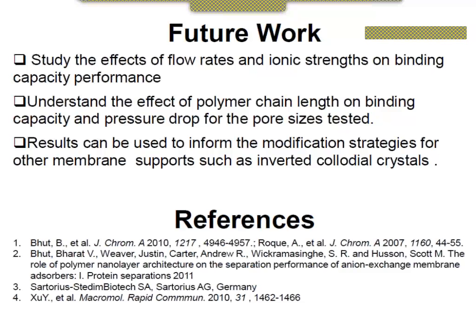What benefits does ATRP have as a polymerization method over other chain growth methods? I think that might have been for Julie. I'm not sure if you're familiar with any other methods. Well, one of the reasons we use ATRP is because it allows better control over not only the thickness of the polymer chains, but also the density, as Ebony was talking about.